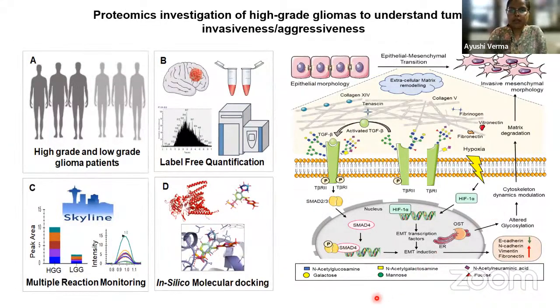We have also performed proteomic investigation, where we have performed label-free quantification, and we were able to understand why the high-grade gliomas are so invasive and mesenchymal in nature. And we have identified many of the protein markers like OST, collagens, TGF-beta, which are responsible for the invasive behavior, and how the interplay works within the tumor cells. So that was also our objective.